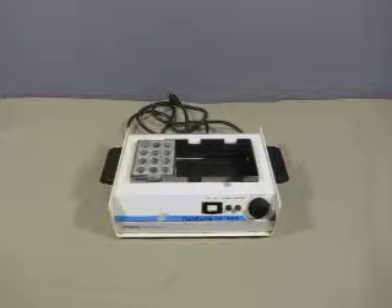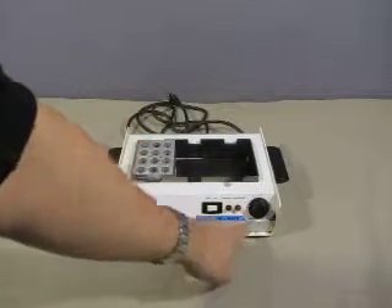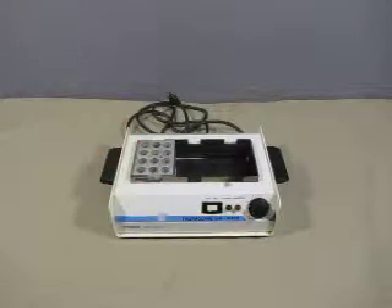The unit itself has an on-off switch, power, control, and temperature ranging from 25 to 105 degrees.